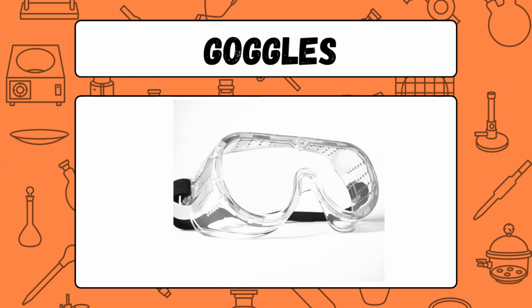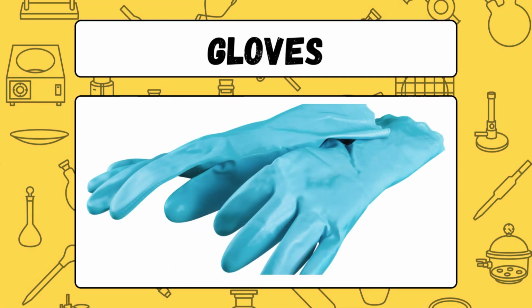Goggles. Goggles are protective eyewear designed to shield the eyes from chemicals, debris, or harmful substances in a laboratory. Gloves. Gloves are protective hand coverings used in laboratories to safeguard against chemicals, heat, and contamination.